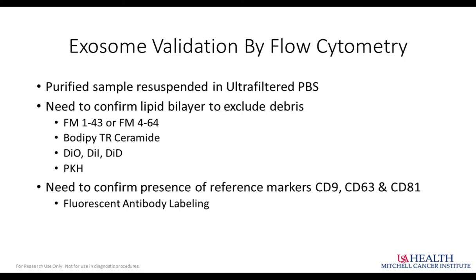The other options, the DiI series, which are actually carbocyanine membrane dyes, have been widely used for many, many years as membrane labelers to do in vivo cell tracking, cell mixing, cell fusion experiments, as well as PKH dyes, which are similarly able to intercalate into the outer membrane.